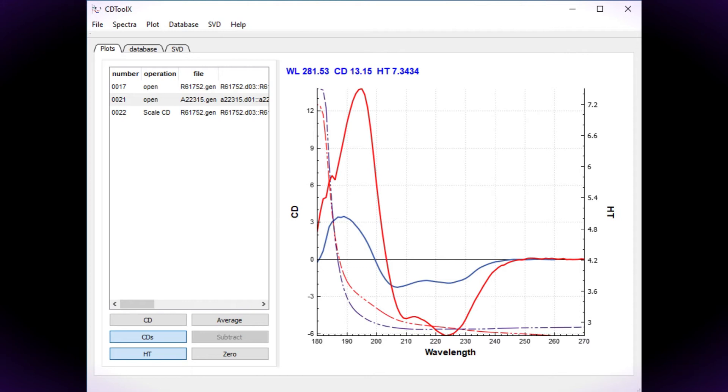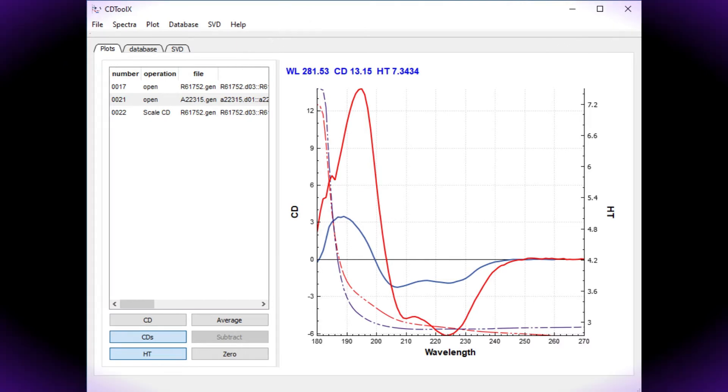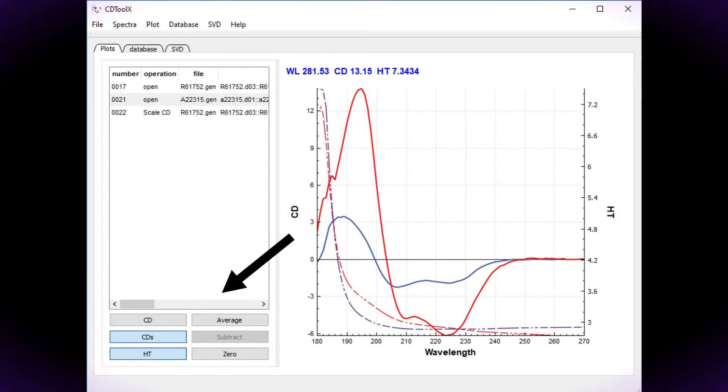The CDToolX interface comprises three tabs. The default view shows the plot window with a list of the loaded spectra on the left. Below this are buttons which allow you to carry out operations and change the views.